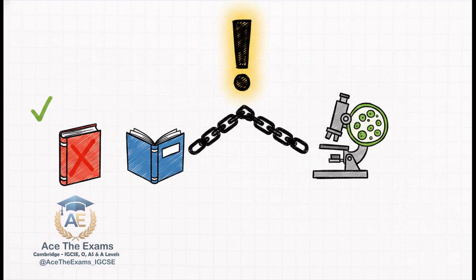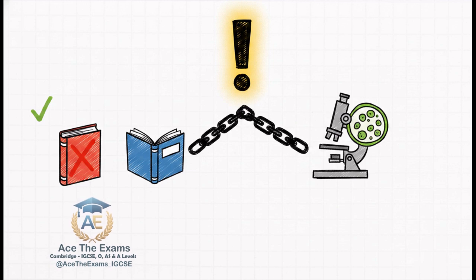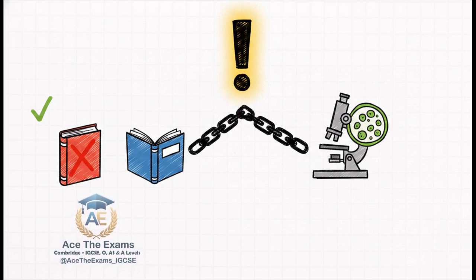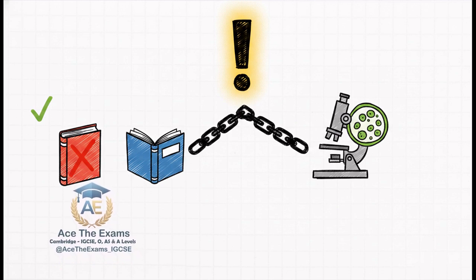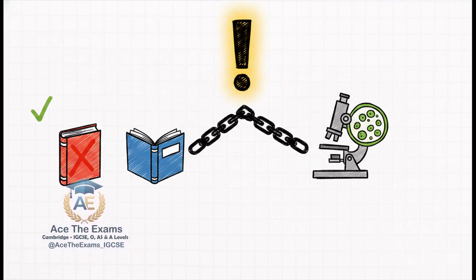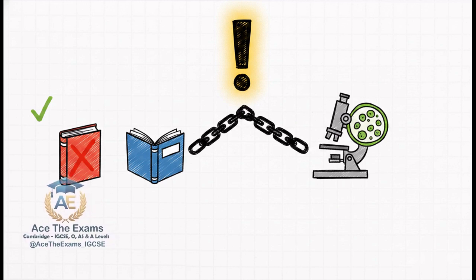Providing generic textbook answers that aren't tied to the actual experimental context in your paper will completely cost you the grade boundary. If your question is about measuring palisade mesophyll cells in a drought-stressed leaf, your answer absolutely cannot just be about calibrating a microscope in general. It has to specifically reference those mesophyll cells and that exact environmental context.